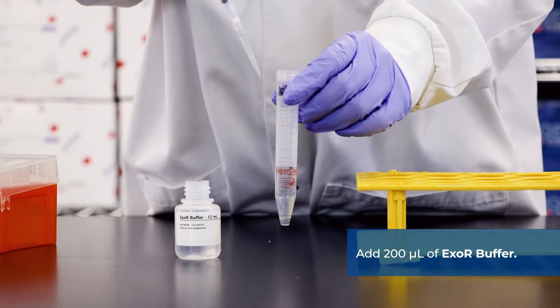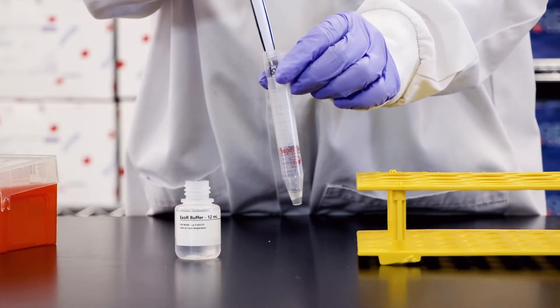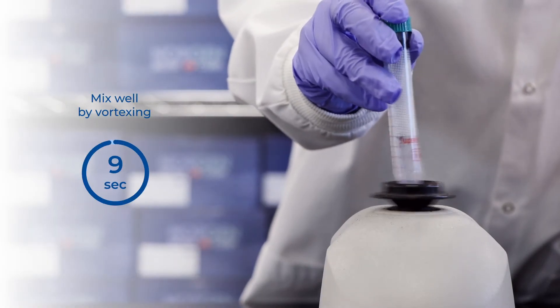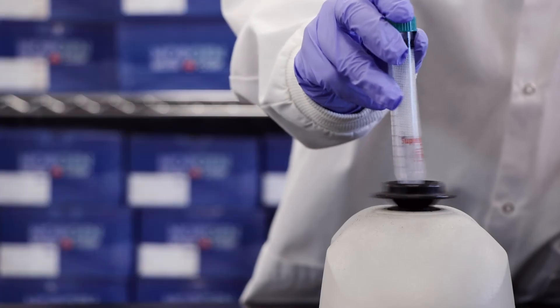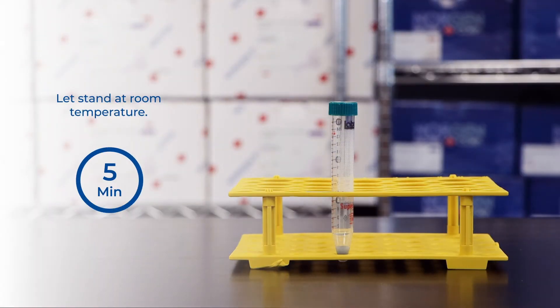Apply 200 microliters of XOR buffer to the slurry pellet. Mix well by vortexing for 10 seconds. Incubate the slurry pellet resuspended in the 200 microliters of XOR buffer at room temperature for 5 minutes.